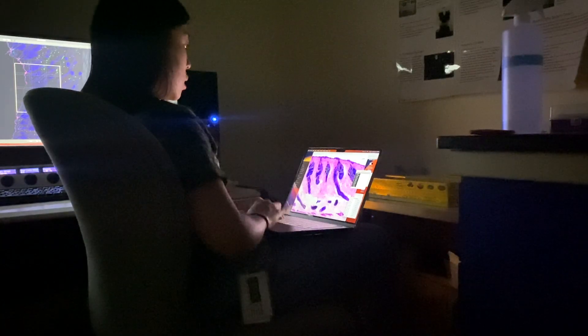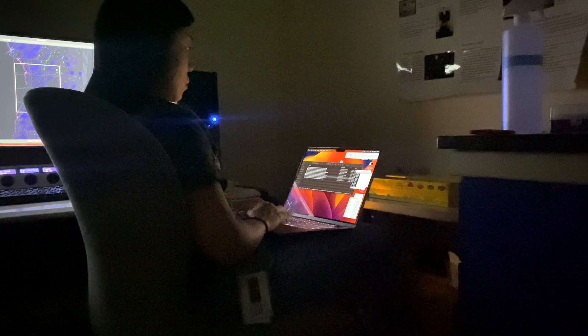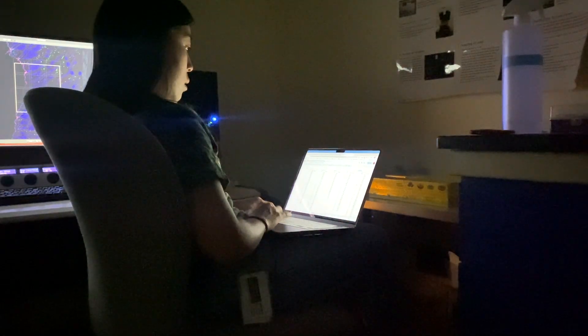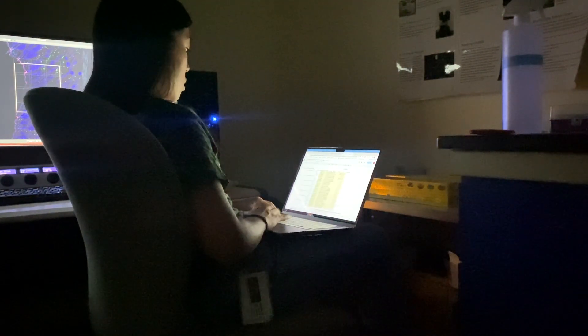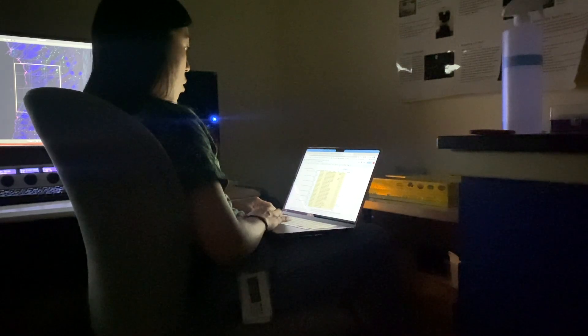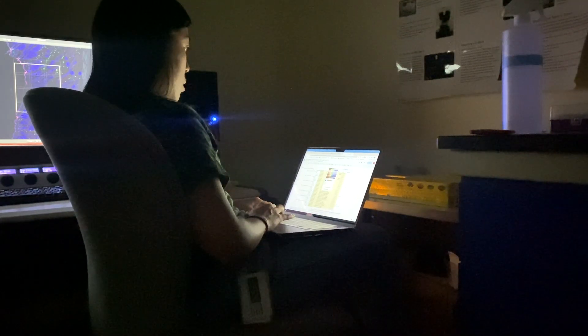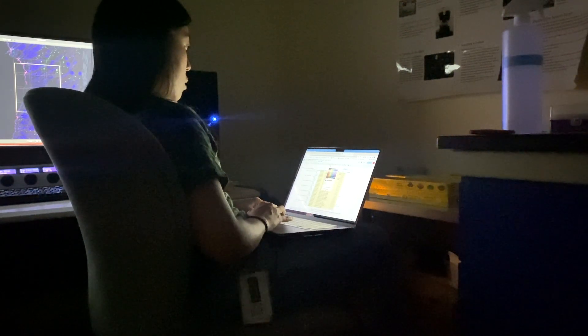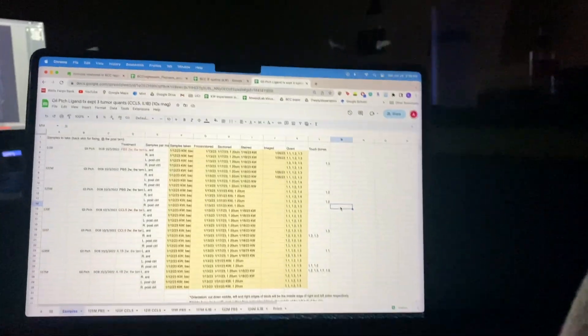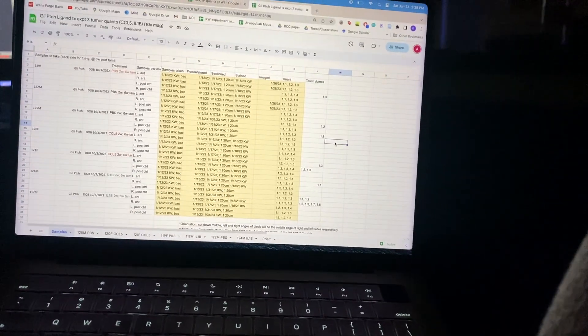This manual quantification takes up a lot of time, but it's pretty mindless, so I can do this while listening to podcasts or music. There are ways you can try to automate this with a computer program, but the biology of our tumors makes it a little difficult to get that working. So lots of tracing and clicking on my computer.